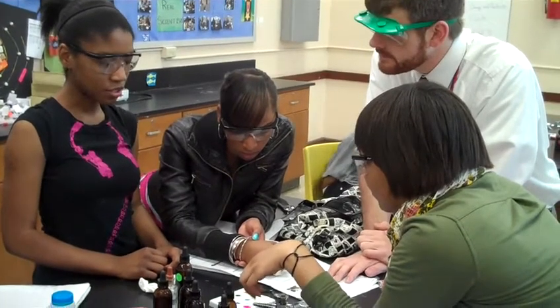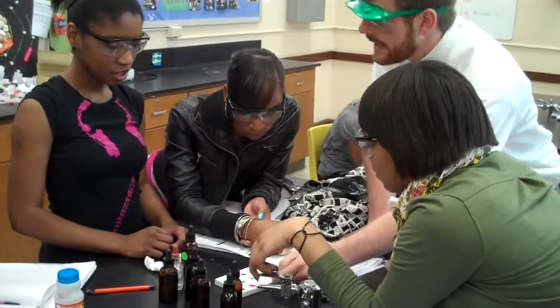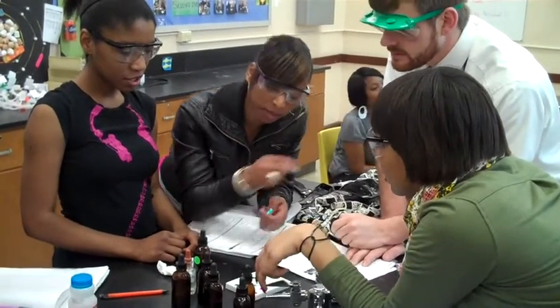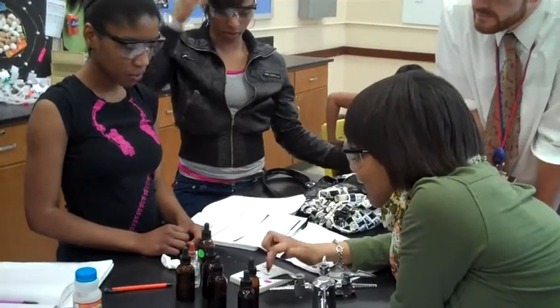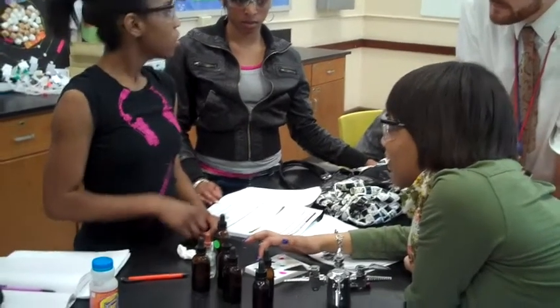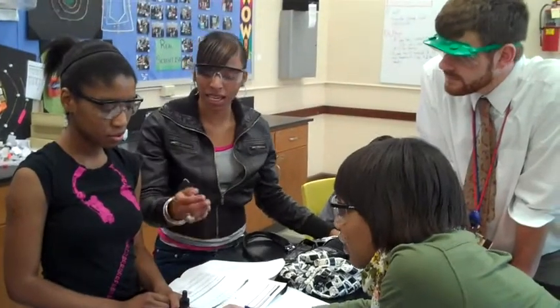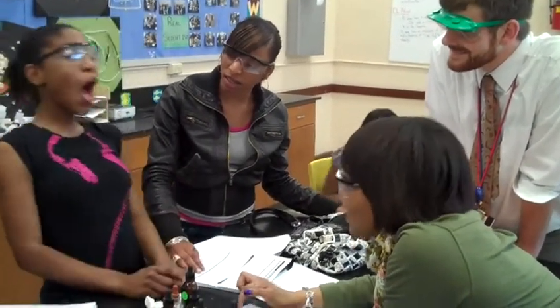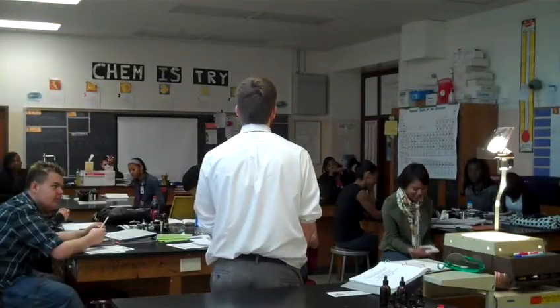I'm really lost. So explain to me why you think it's a base or a neutral or an acid. I don't know. No, okay, you see how these are three different colors? This matches this, and that would have matched that if it hadn't been something else. So why can't it be neutral? Because it's in a base spot. Oh, this whole row is base? This whole row. Oh! I'm with y'all. How do you think that it matched the base?